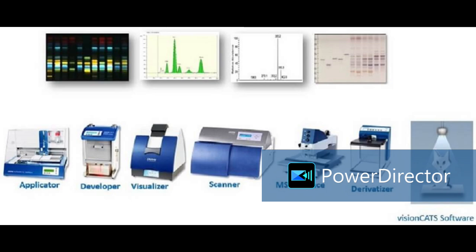So in phytochemical analysis, these different derivatizing reagents, as ma'am just said, they are currently doing in test tubes, biochemical tests for alkaloid detection and phenol detection. All that similar kind of biochemical test we can convert to HPTLC. For example, after separation, if we want to detect phenol, we dip the plate into alcoholic FeCl3 reagent. Phenolic components will show blue, bluish color bands. And with Dragendorff reagent, the alkaloids will show an orange color band.